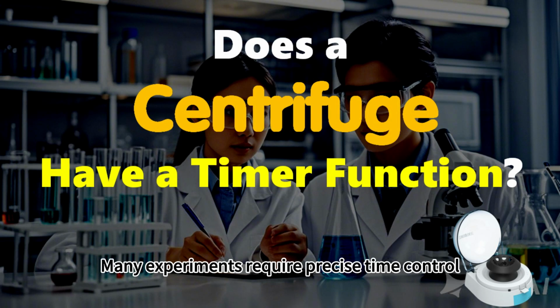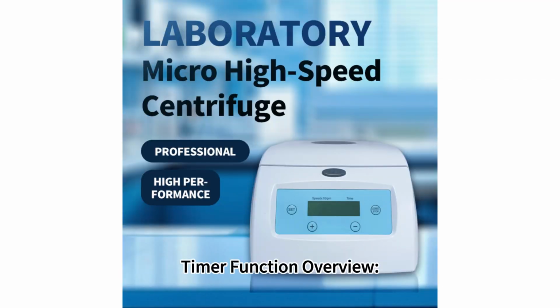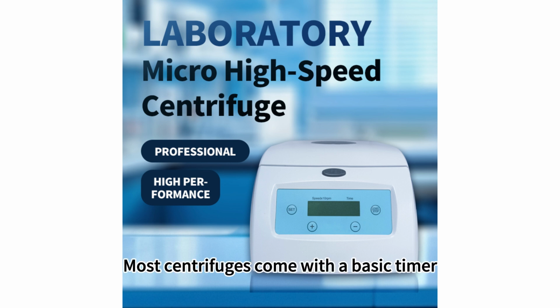Many experiments require precise time control, and a timer function can automate this process. Timer function overview. Basic timer feature. Most centrifuges come with a basic timer. Importance: it sets the duration of the centrifugation cycle.